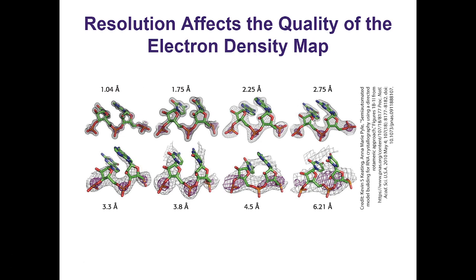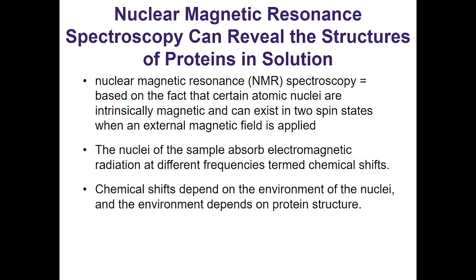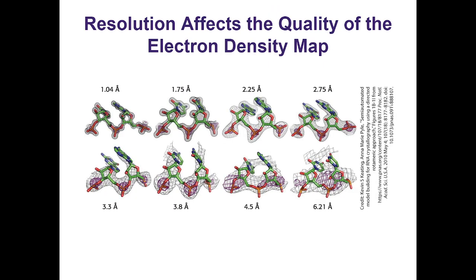But when we have a larger number, for example, up at 2.75, we can no longer resolve that, right? Basically, past 1.75, we lose that resolution. Okay? We get up to 6, and we can't even resolve what's in there, right? Everybody see that okay? Okay, so your resolution makes a big difference on what exactly you can resolve, but you can get overall three-dimensional structures.